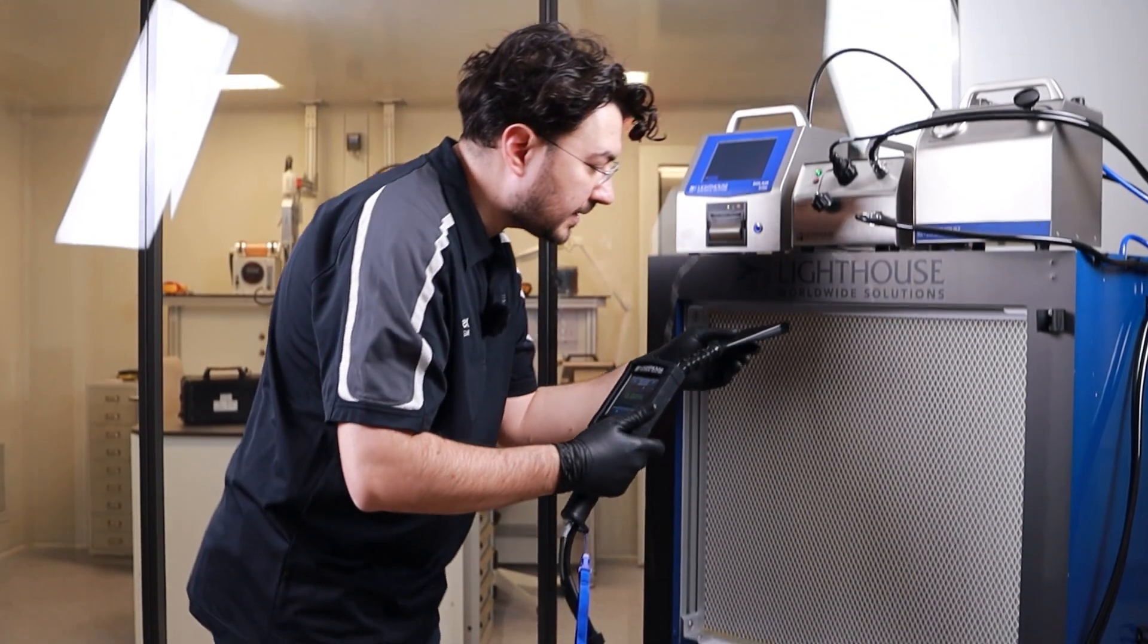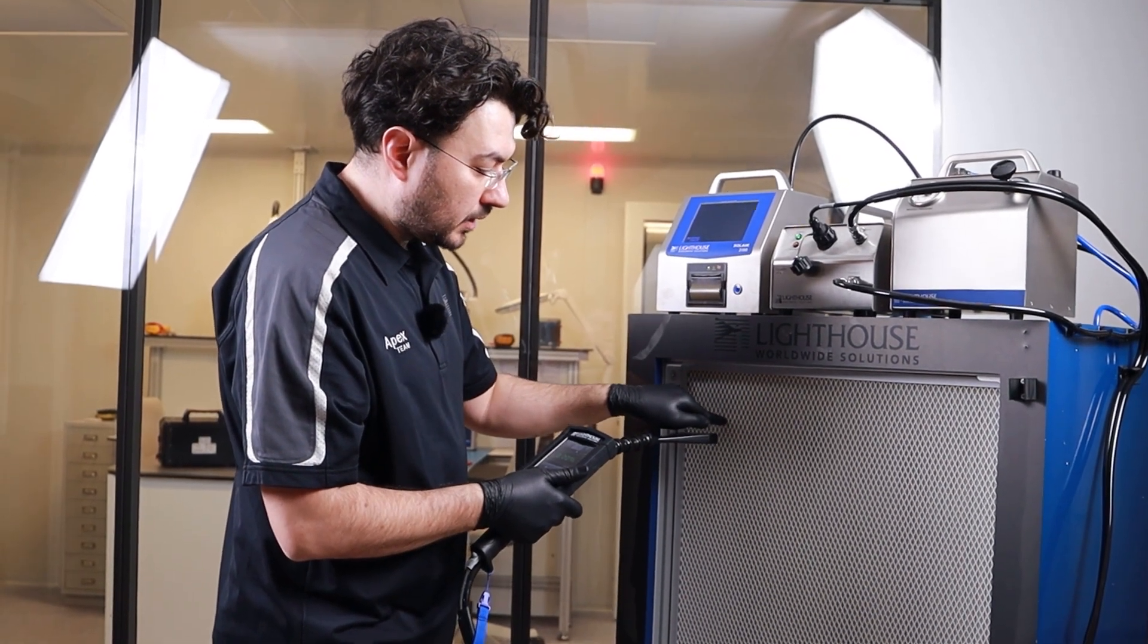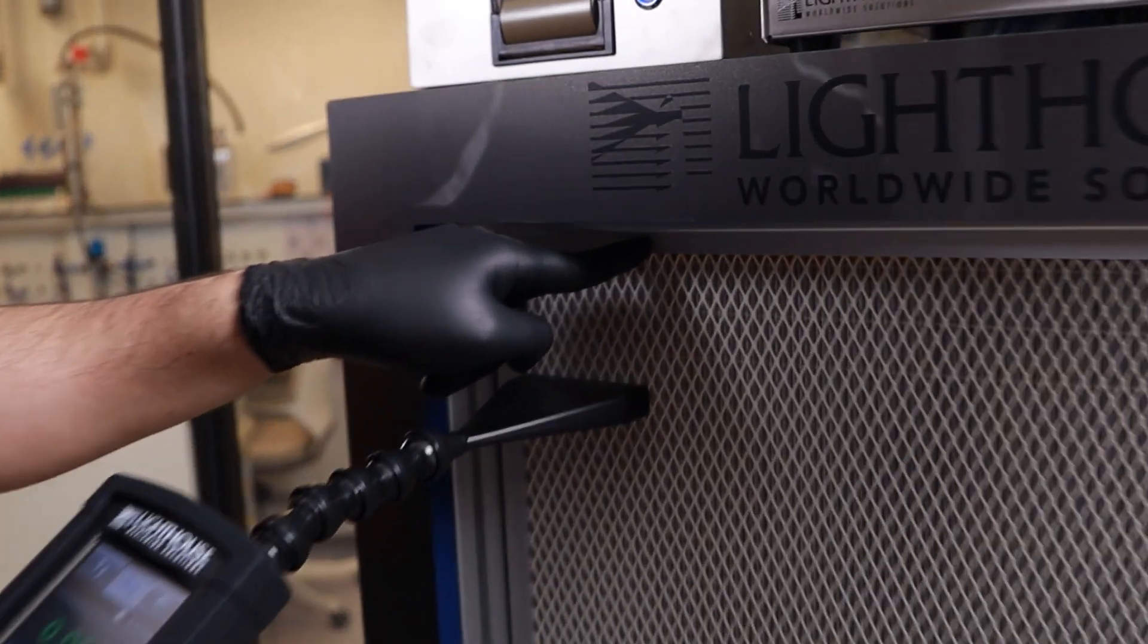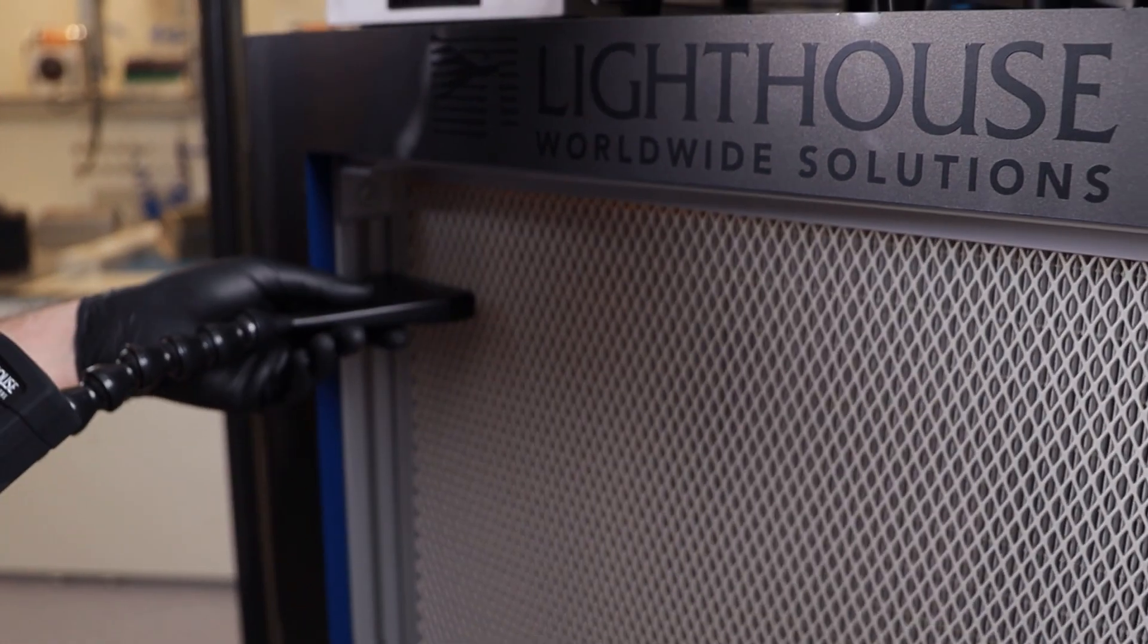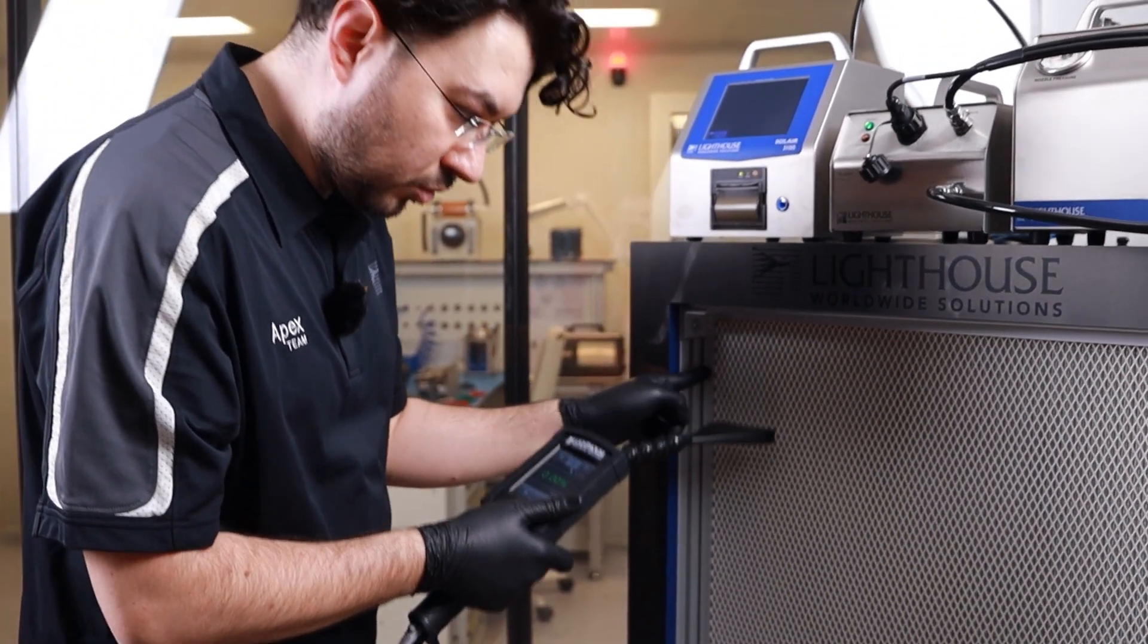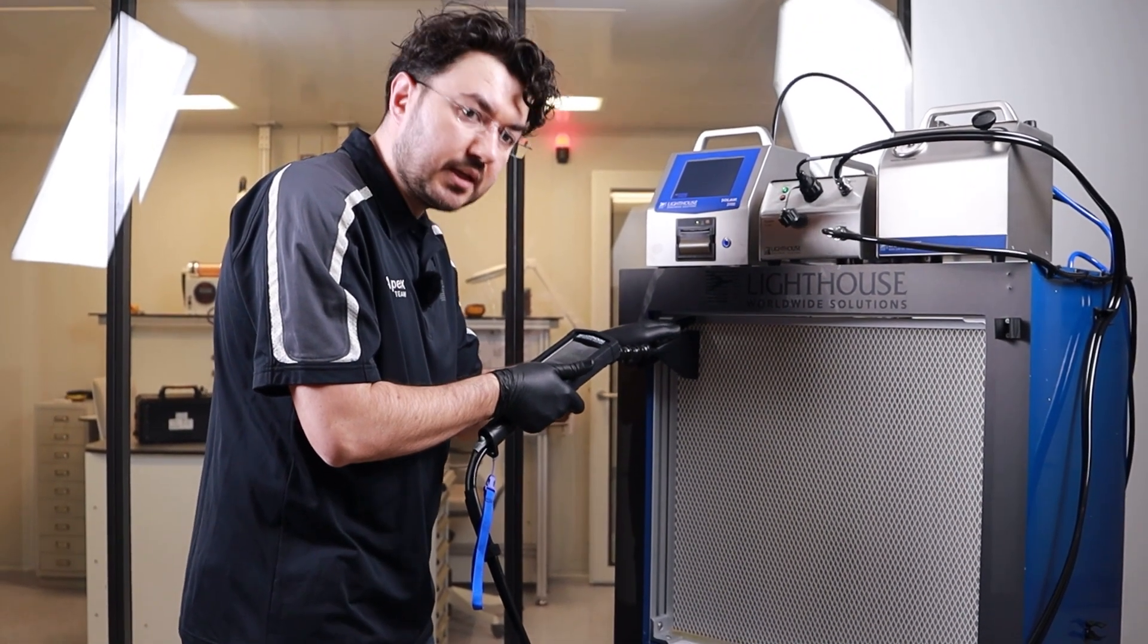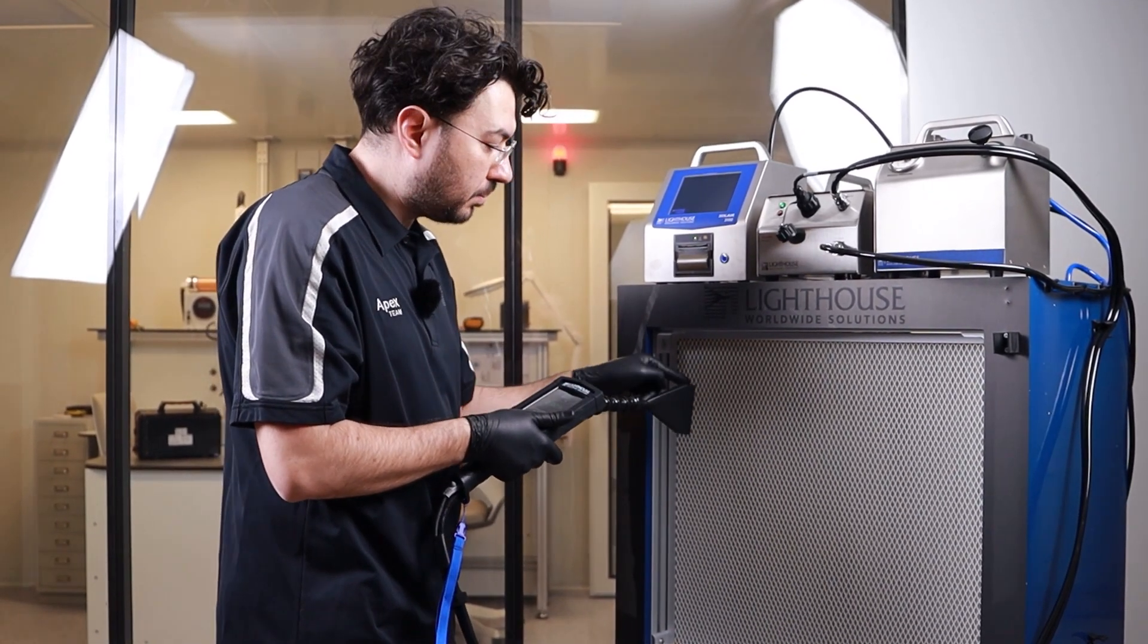And once you find any leakage like this, the one we find already, instead of putting the mark into your HEPA filter surface, it's better to make a cross section, mark it here and the second one mark it this way so that the cross section will tell you where the leak is. In general, the system when you scan, go down below, if you find any leakage here, put marker number 1 here, move on. Once you're done, to find the right point, try to scan that way, find the leakage and put your second marker with the same number into this point. So the cross section will be the point of leakage.